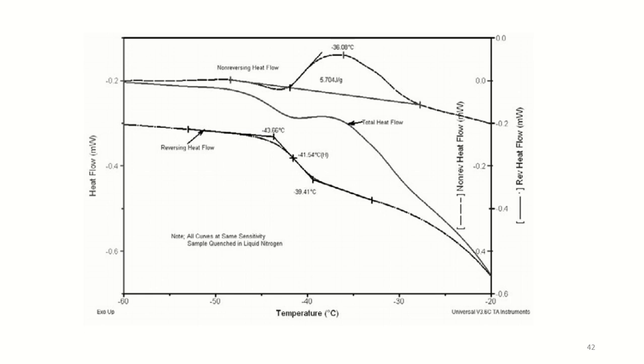conventional differential scanning calorimetry usually does not observe sharp changes or peaks in close temperature proximity. It is unable to record clear information about the enthalpy change of any sample.